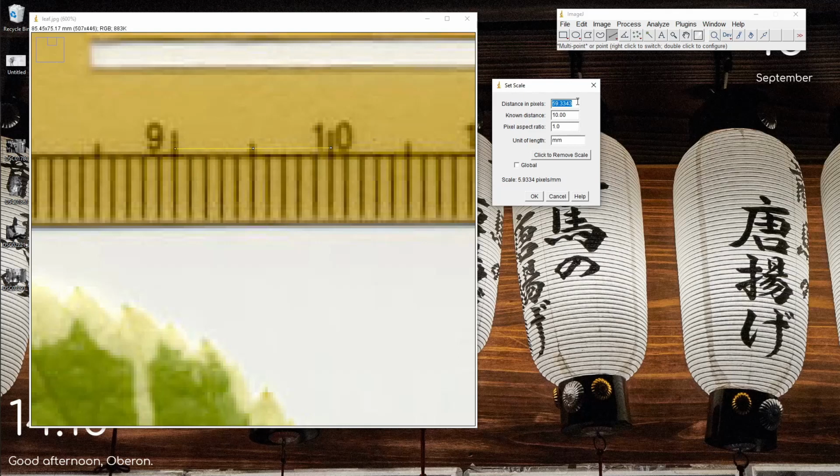There's a little bit of error between two people reading the scale. But in terms of statistics, you make sure that your error is constant. So at least you're making sure that you're measuring it your way and I'm measuring it my way, and there might be some discrepancies, but it's going to be very small. So that's the idea here.